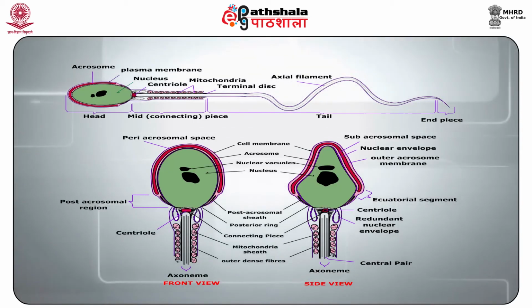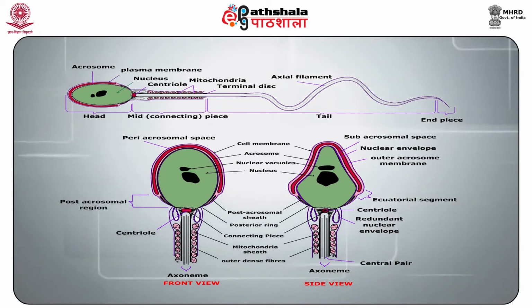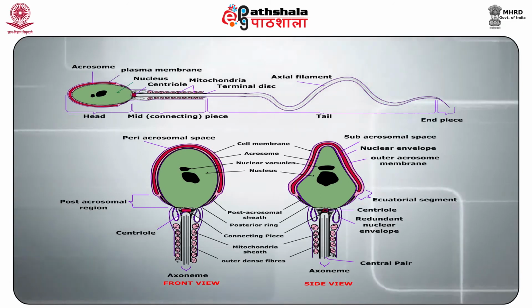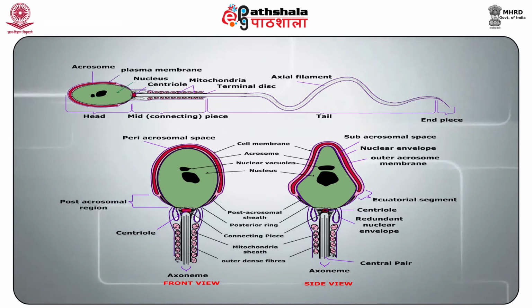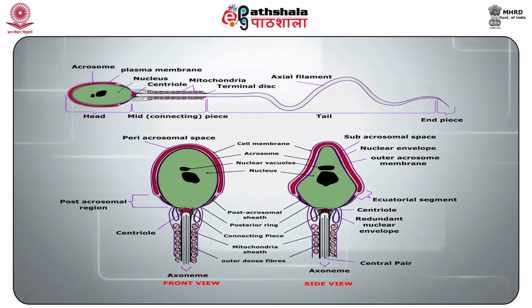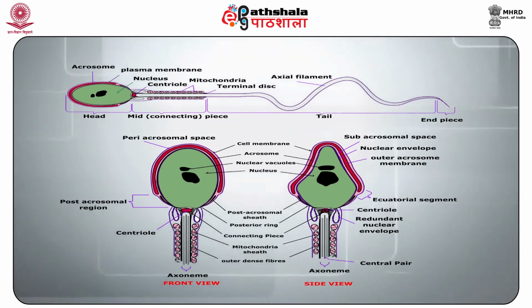Items that have been tested presumptively positive for seminal fluid using the AP test can be confirmed either by microscopic detection of spermatozoa or chemical detection of semen-specific protein. Positive swabs or a small cutting from a positive stain can be smeared onto a microscope slide and then stained for visualization.